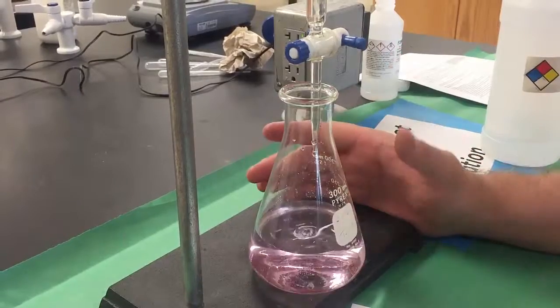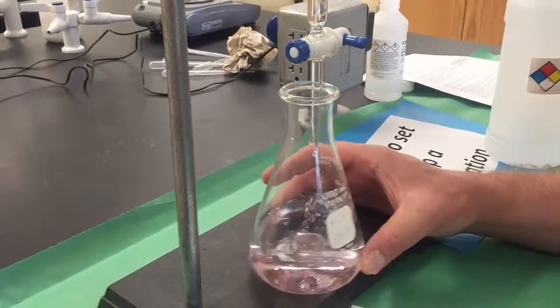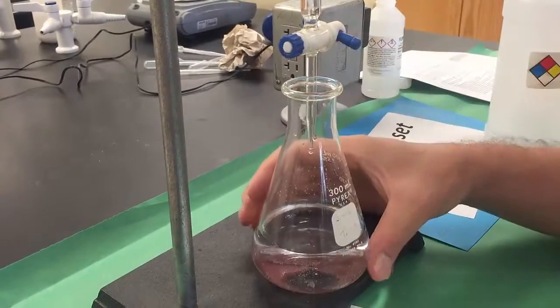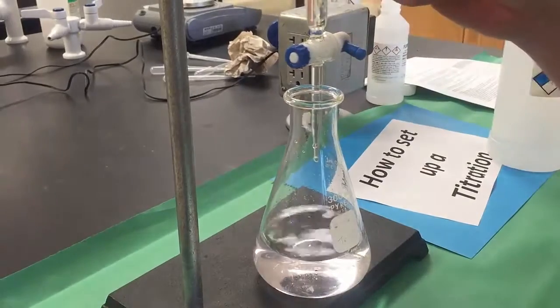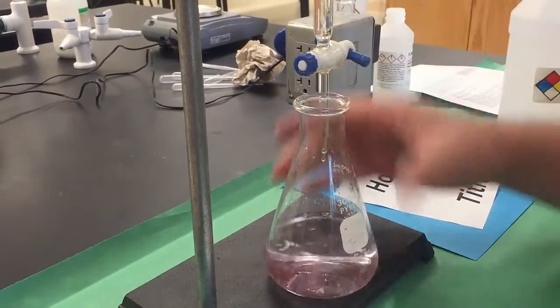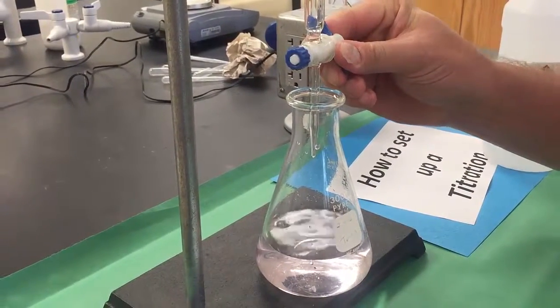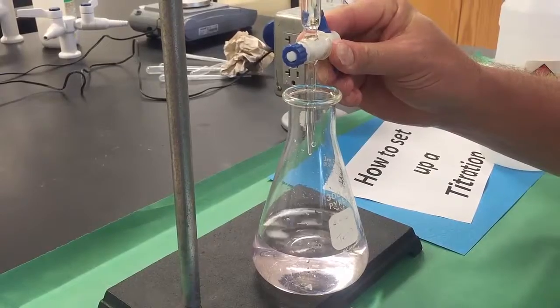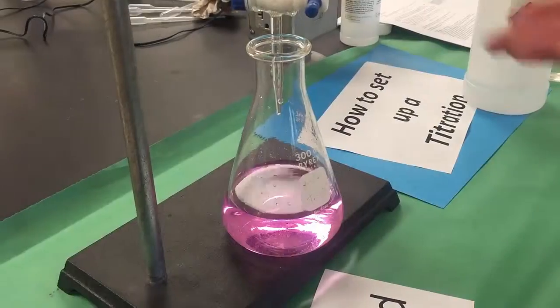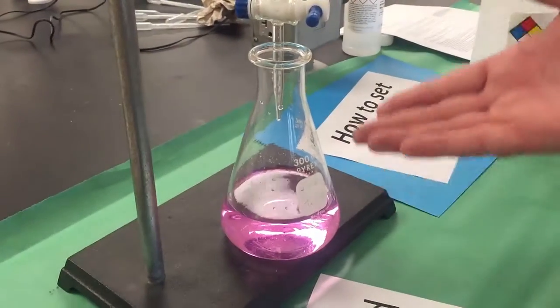Look at that. It's probably going to go back to clear, but what that tells me is if I could just get that one more drop, that might do it. So we're very, very close. And that is the secret to titrating. We hit our endpoint. The fainter the pink color, the better you did.